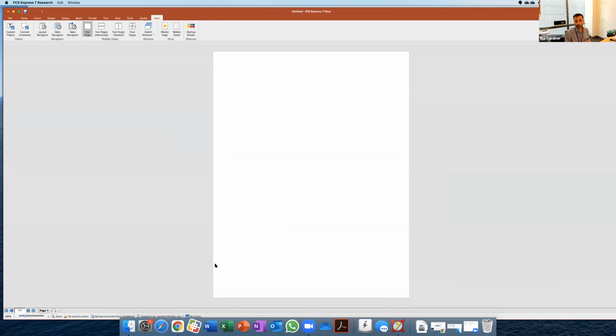I have to say I had more experience with it on a PC, and I think the Mac version probably is not as stable as one would wish, but it still works pretty well. The big difference between the PC and the Mac is that with the PC you can just copy and paste the plots, the objects, to PowerPoint, and then you can ungroup and convert it to a PowerPoint object, which is quite nice.